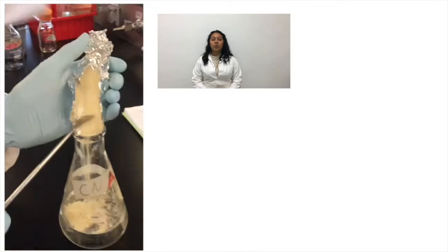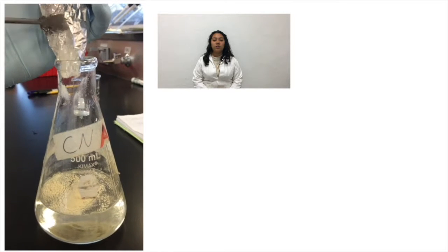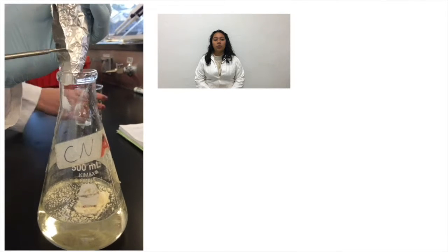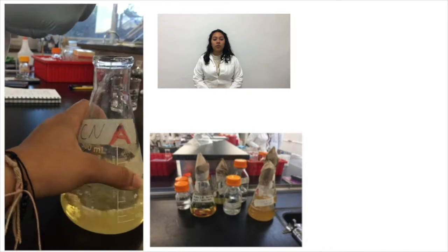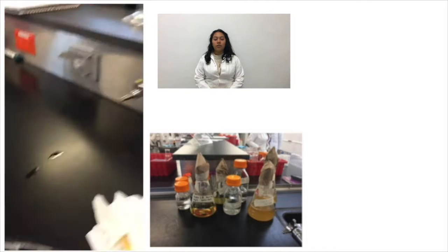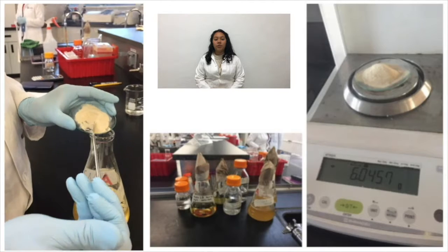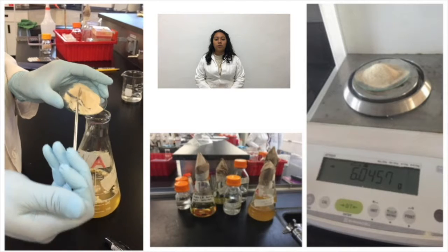A correct technique to prepare a solution is, first, make the necessary calculations to obtain the required concentration. Next, measure the calculated quantity of solute or solutes. Then, fill half of the volume of solvent in the container. Next step is to pour the solute or solutes in the container and, if necessary, rinse the container to avoid losing part of the solute. Then, stir the solution until the mix looks homogeneous. Finally, fill the volumetric container to the wanted volume.